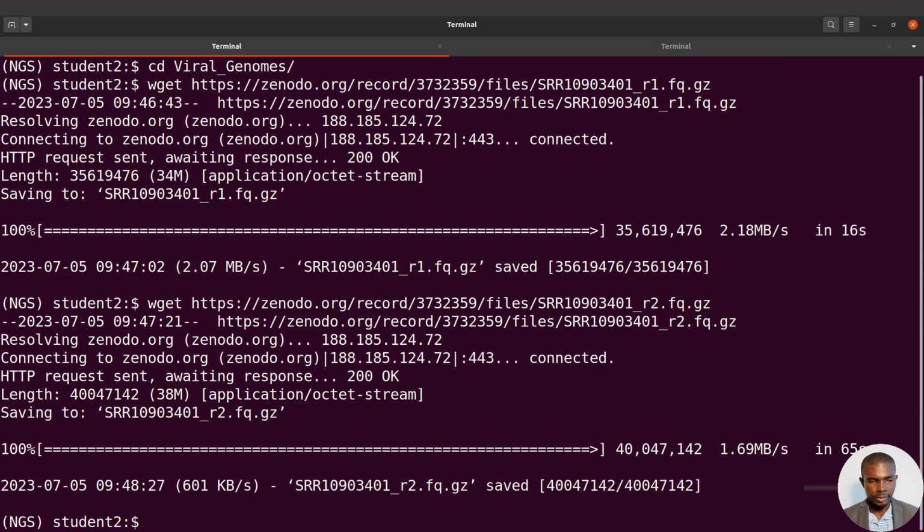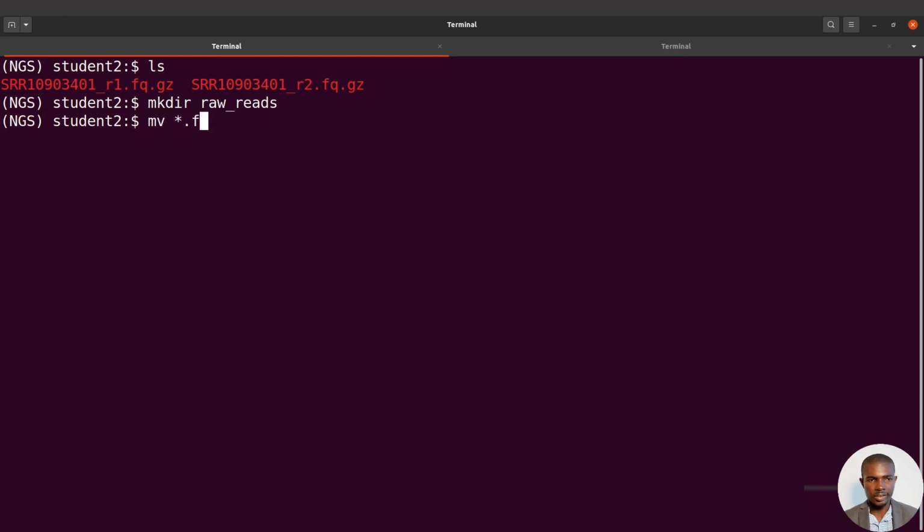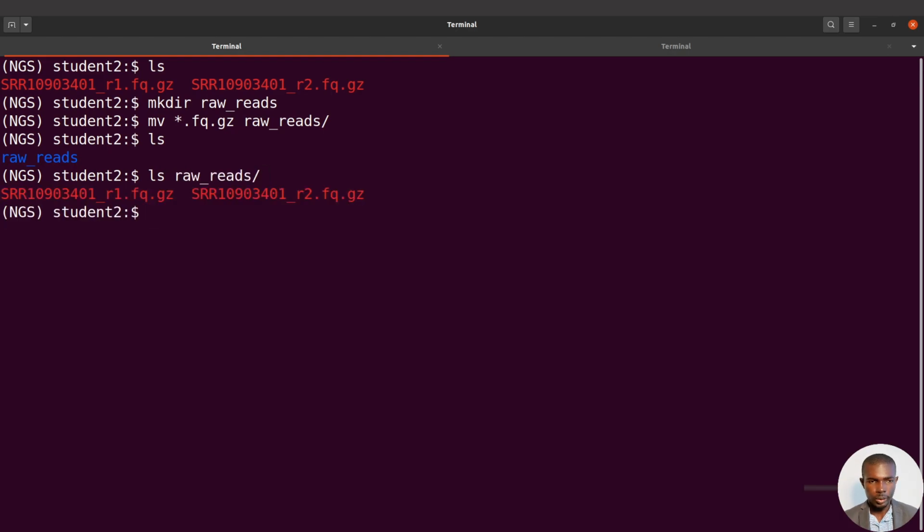Okay, so we have downloaded the files. Let's take a look at them. So I have them here. So I have my paired end reads. Now I'll create another directory and then move them there. So these are the raw reads. So I'll say make the raw reads. And then I'll move the files. So I'll say mv star.fq.gz. And then I will move them to raw reads. Now if I do an ls, I'll find my directory called raw reads. And in that directory, I will have my files.